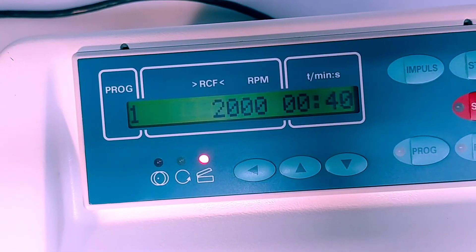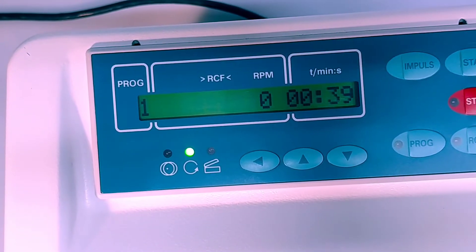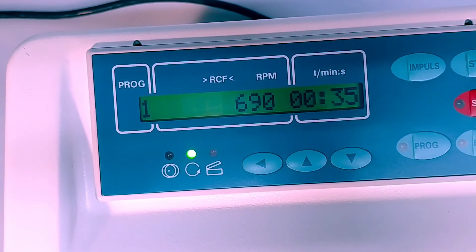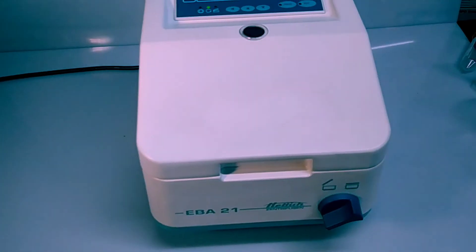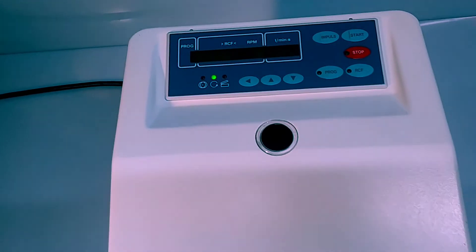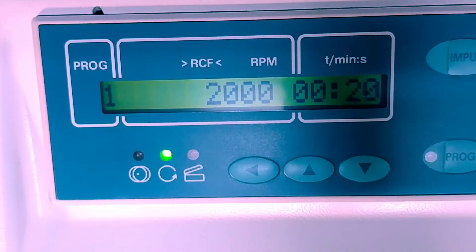Okay, we're ready to do a trial run. We'll just hit start — the unit spins up. Really nice and quiet. A really nice little unit. We're running the profile as we programmed it, and we've got 21 seconds left.